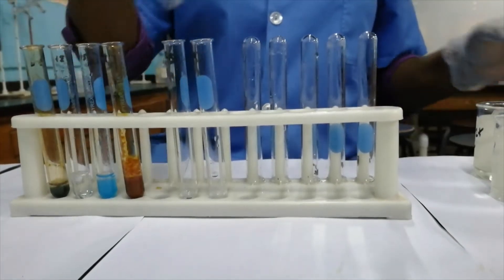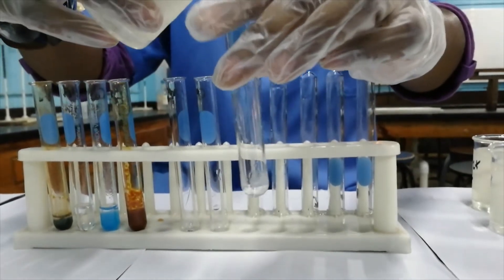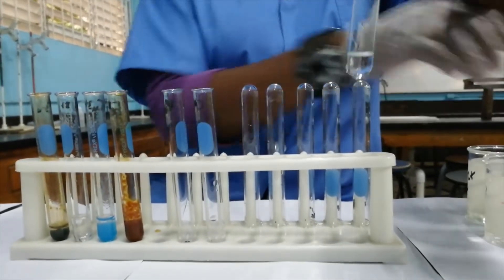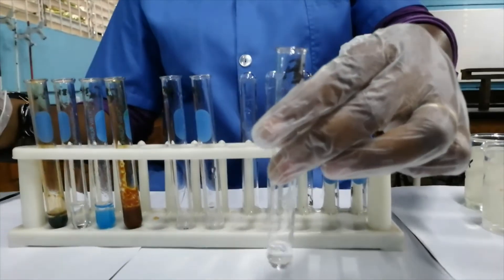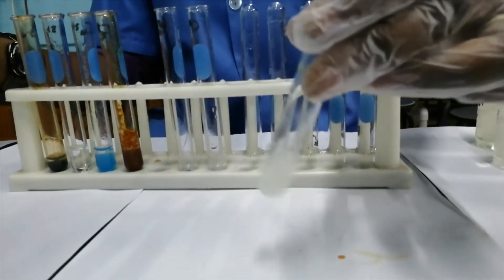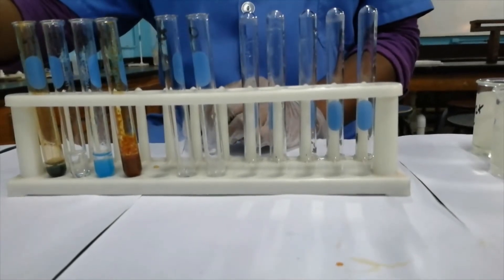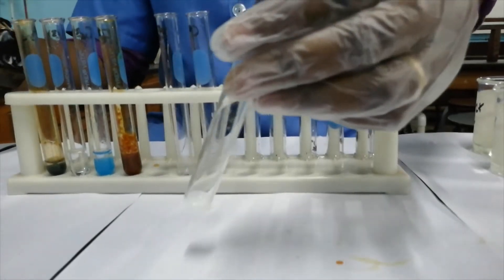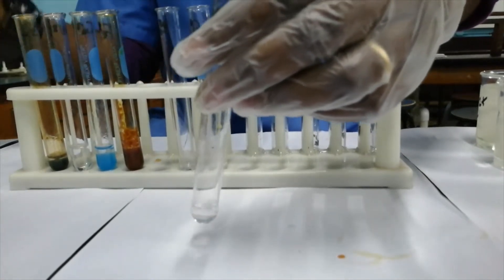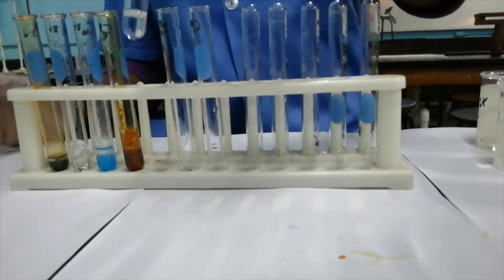The next cation that we'll be testing for is the lead cation, Pb²⁺. It forms a colorless solution, just like aluminum. If we add sodium hydroxide to it, then we get the formation of a white precipitate. Let us now test if the white precipitate is soluble in excess — the white precipitate dissolves in excess sodium hydroxide.